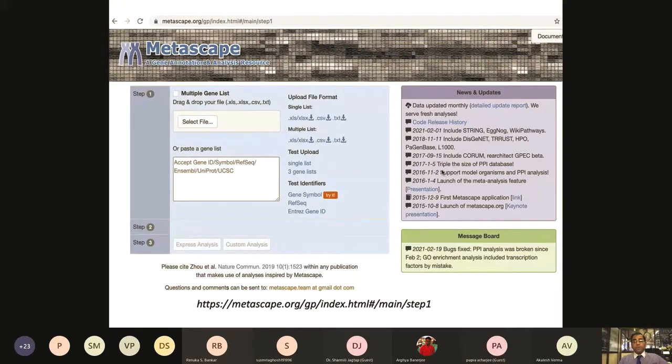Now we are going to have a data analysis part, taking any data set of proteomics, not necessarily only protein arrays, but protein arrays or mass spec. They're both going to provide you big data sets, which have to be analyzed to make biological sense of that data. And that's where different software and open access tools are very handy, which provide you biological insight of your data. Metascape is one of those.